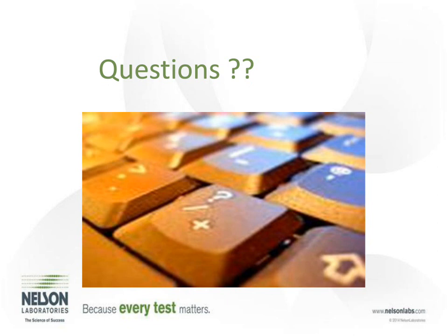10993-5 now says quantitative method is preferred. Should we use an assay such as the MTT cytotest? That's a great question, too. So you're right, the quantitative method is preferred, but there's been some issues with the MTT test. There's been discussion where we've actually seen the MTT test be more sensitive than the MEM test. And the MEM test is already, in some people's opinion, too sensitive for medical devices for some compounds. So we're making the most sensitive test more sensitive by using the MTT.